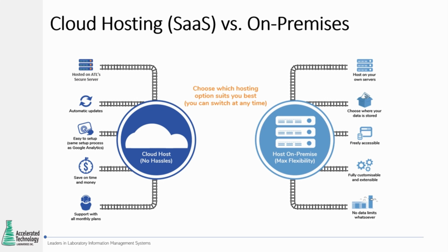They have IT people leased in the cloud as well that are doing all of the maintenance, the daily backups, the antivirus, the vulnerability testing. That's all done through the hosting partner. So it really frees up the laboratory to focus on their core competency. So we've seen more and more people moving to the cloud in the last 5 years. It really is the future because you can really leverage the cost savings.